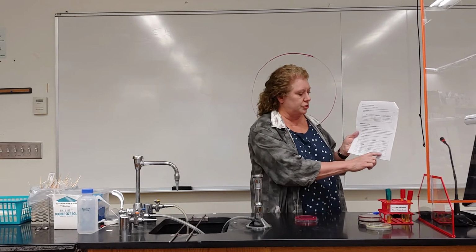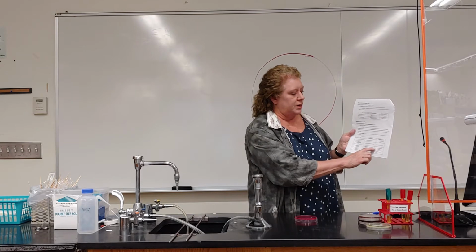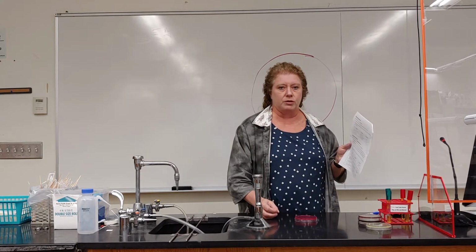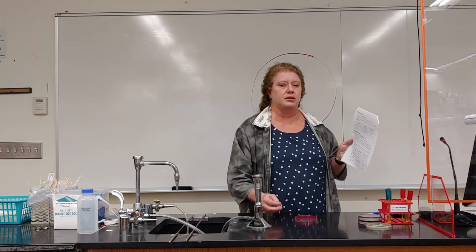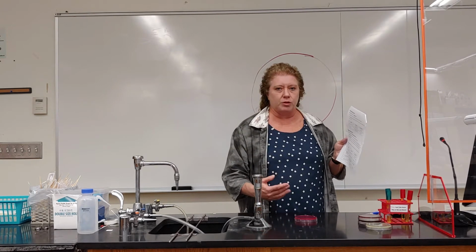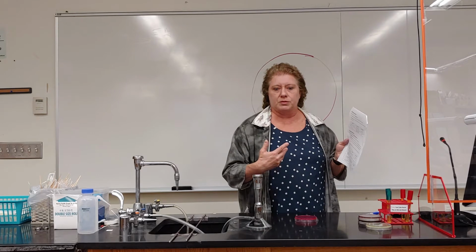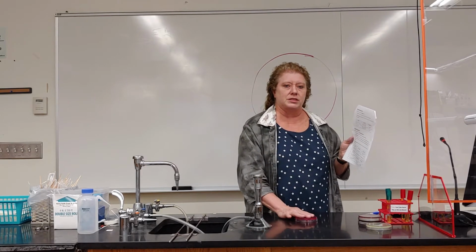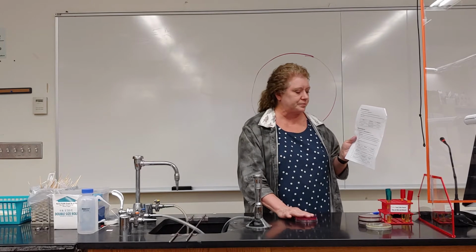So that tells you, as a presumptive ID, it is a possible pathogenic Staphylococcus aureus, which can be important because that can be a pathogen. It could be a problem in a wound, or if somebody has staph poisoning or something like that. So that would tell you that that's Staphylococcus aureus most likely.